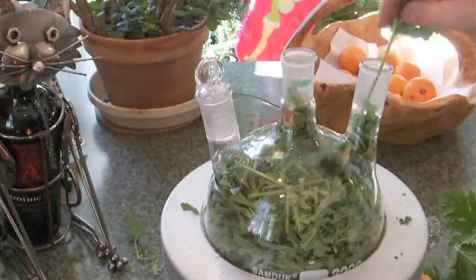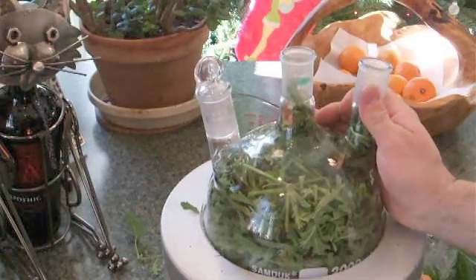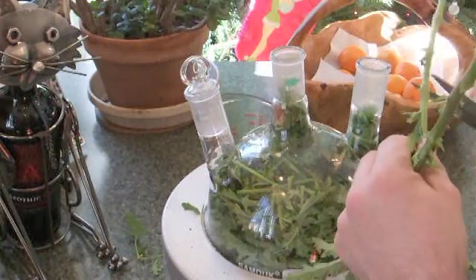This is a two-liter round-bottom flask. I've got this from eBay and what you see here is a heating mantle which it fits in quite nicely — again, also from eBay.